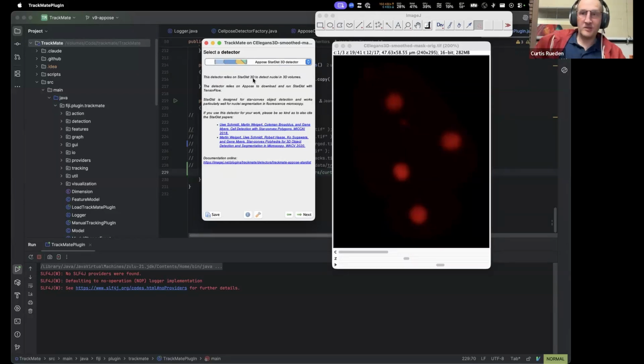That's tricky because there's no general StarDist 3D model. There was a generalized StarDist 2D model that everyone is using. But in 3D, it has 3D support, but it's hard to make a generalized 3D model. And so we're going to be using 3 models developed by Florian Levitt and his group, which he published and is documented in the Git repo.